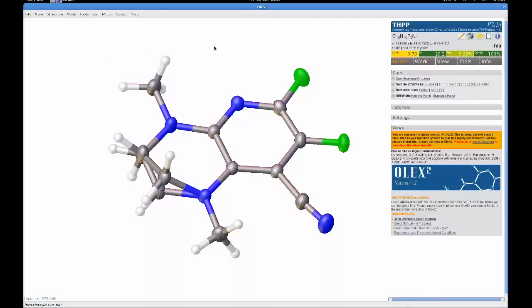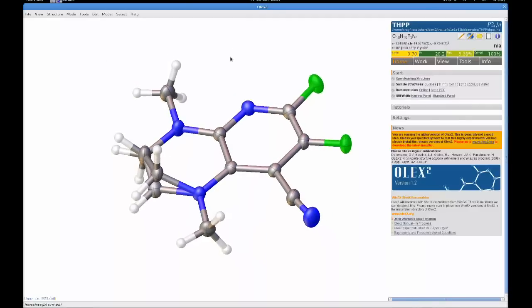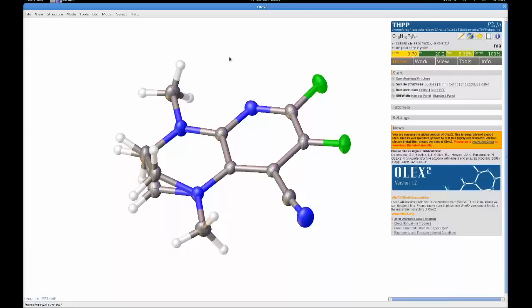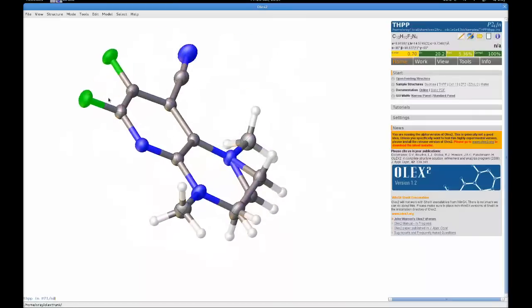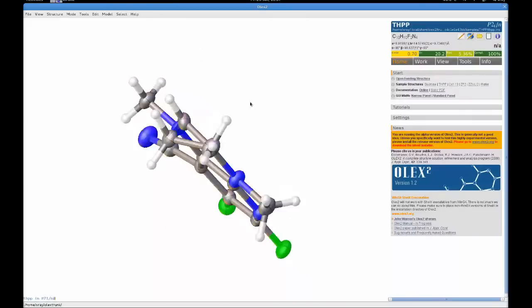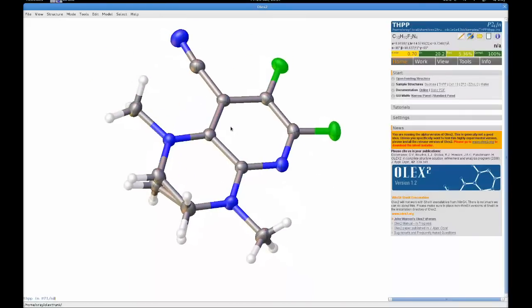Okay, so I thought I would briefly talk today about Olex2. This is basically me playing around with the desktop recording software. I know I've got an audio issue which I'm trying to resolve, so this is just really a quick demo to see what levels I need to set things for video quality and to make sure that people can follow what's happening on the screen easily enough.